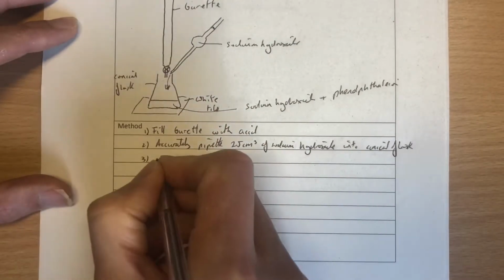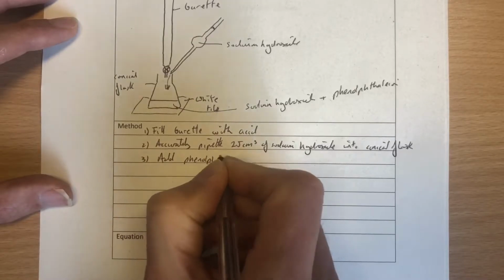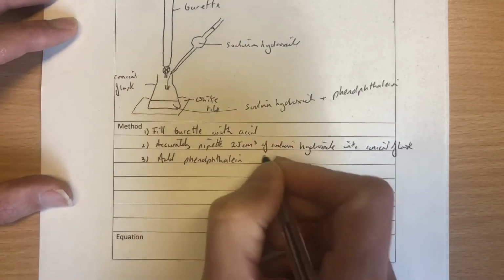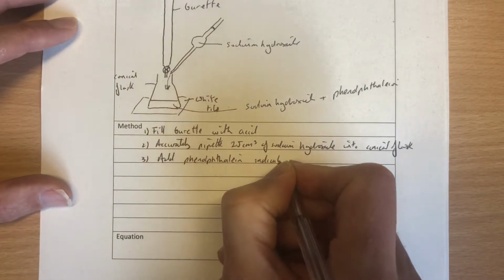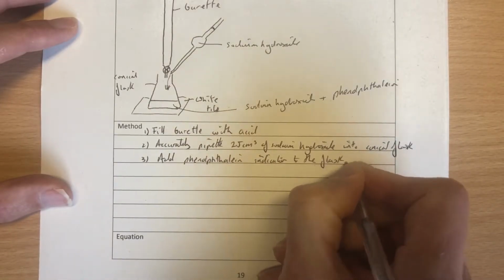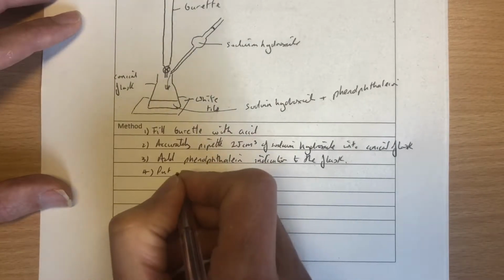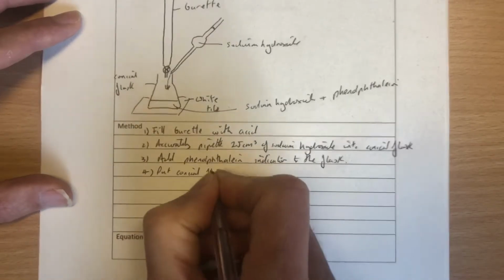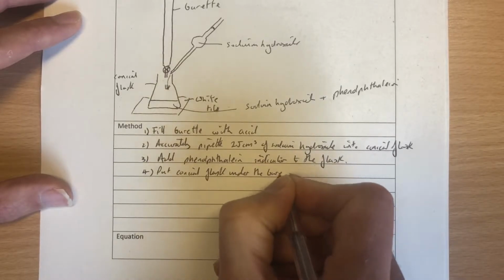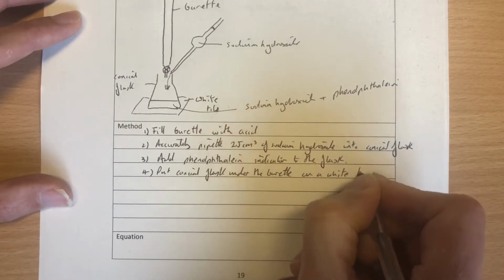3, we're going to add phenolphthalein indicator to the flask. 4, we're going to put the conical flask under the burette on a white tile.